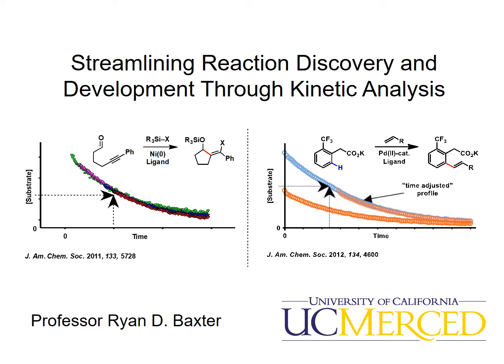So today I thought it would be very interesting to talk with you about some kinetics that I've been involved with, and I'm actually going to go all the way back to some of my graduate work at the University of Michigan and talk about some initial rates that I did in nickel-catalyzed reductive couplings, and I'm going to compare and contrast that to subsequent chemistry I did at the Scripps Research Institute using reaction progress kinetic analysis.